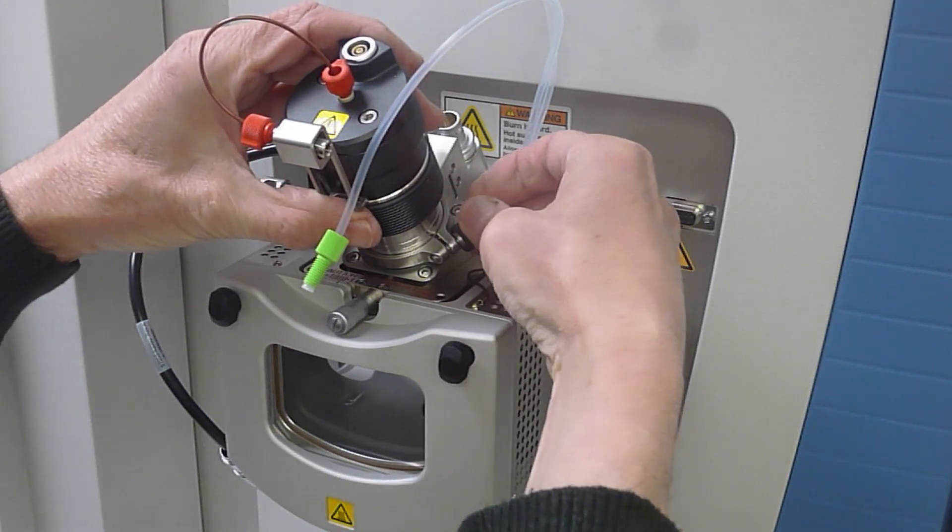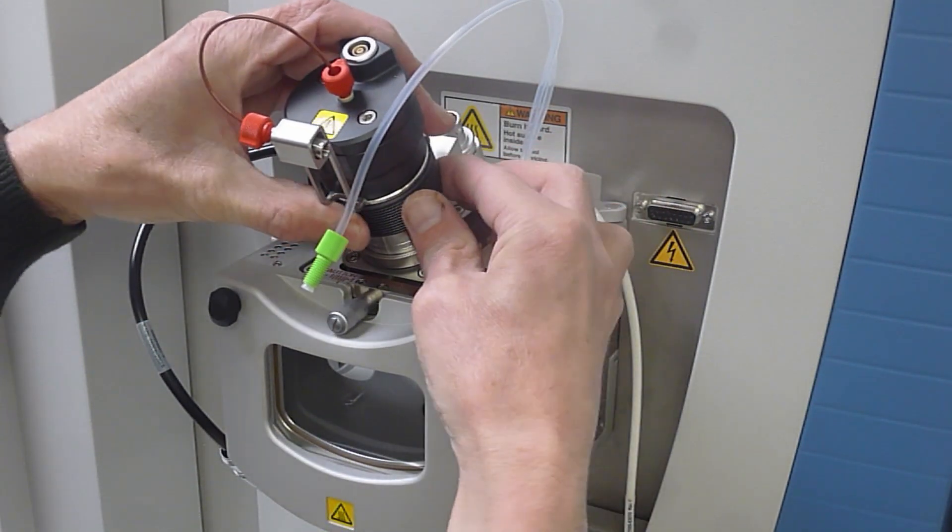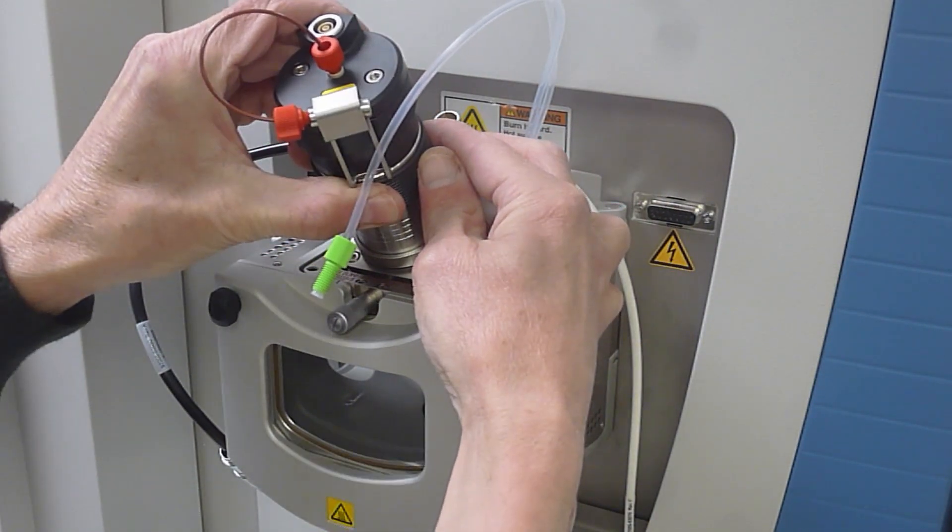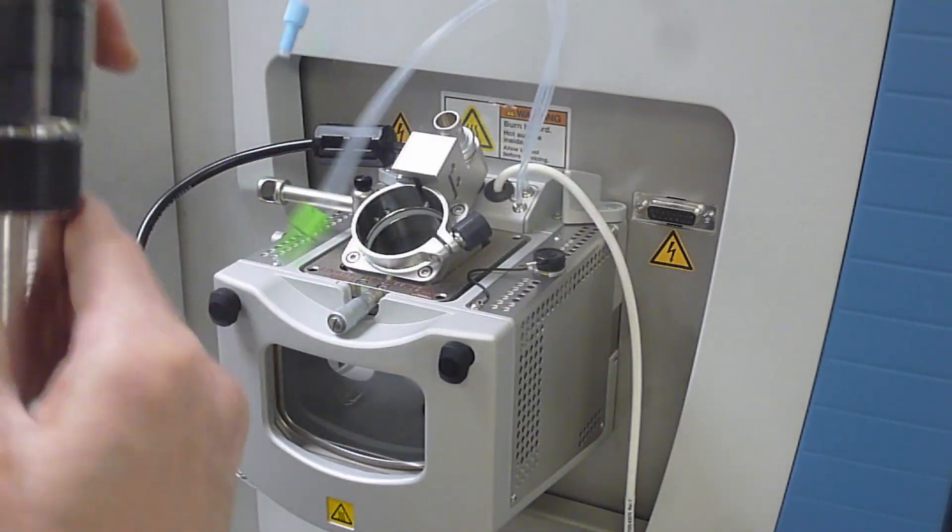Loosen the black knurled screw. Pull the probe towards you until it stops, then turn it anti-clockwise and continue to pull to remove it completely.